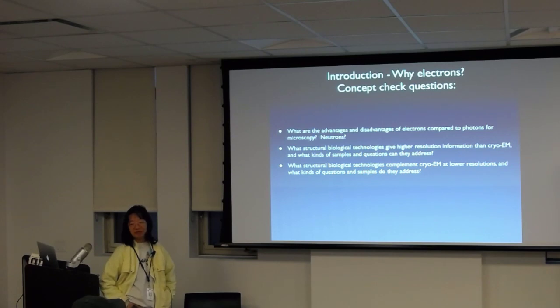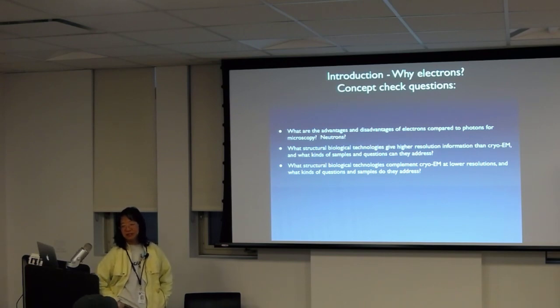Folding and flexibility. Yeah, dynamics. NMR can give you nice dynamic information. Cryo-EM is getting to the point where maybe it can do that as well. Are there any other techniques besides the big three? Depends on what you're talking about.